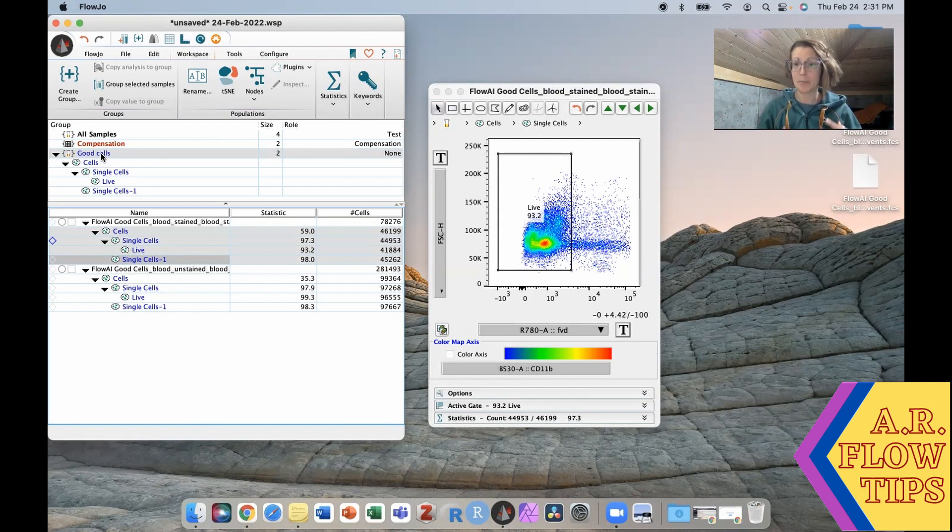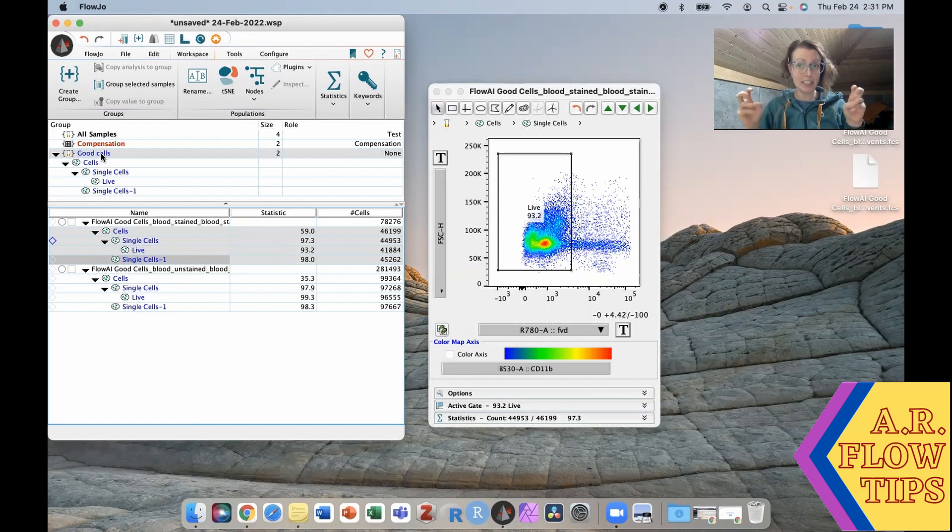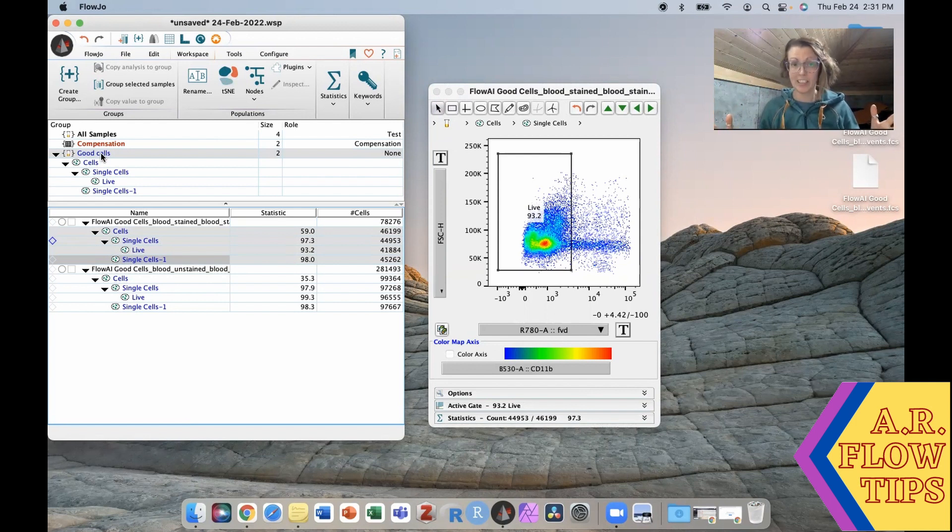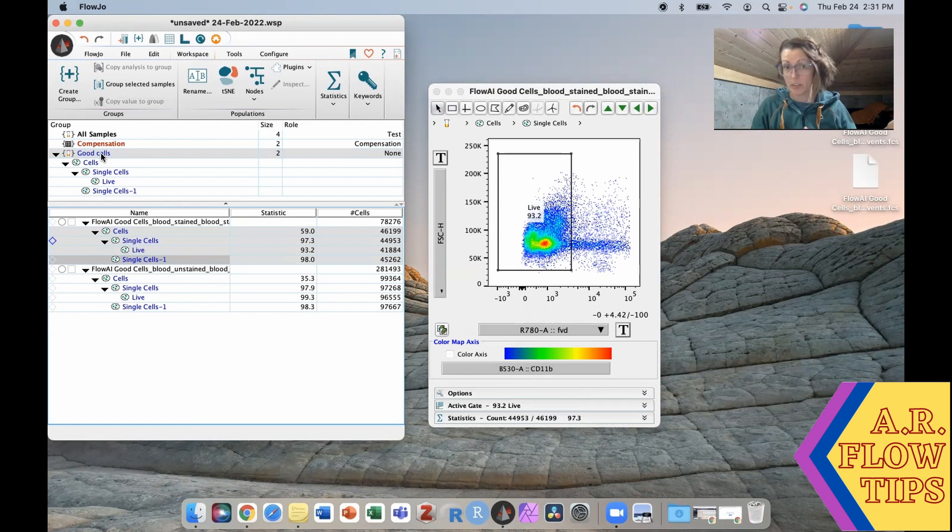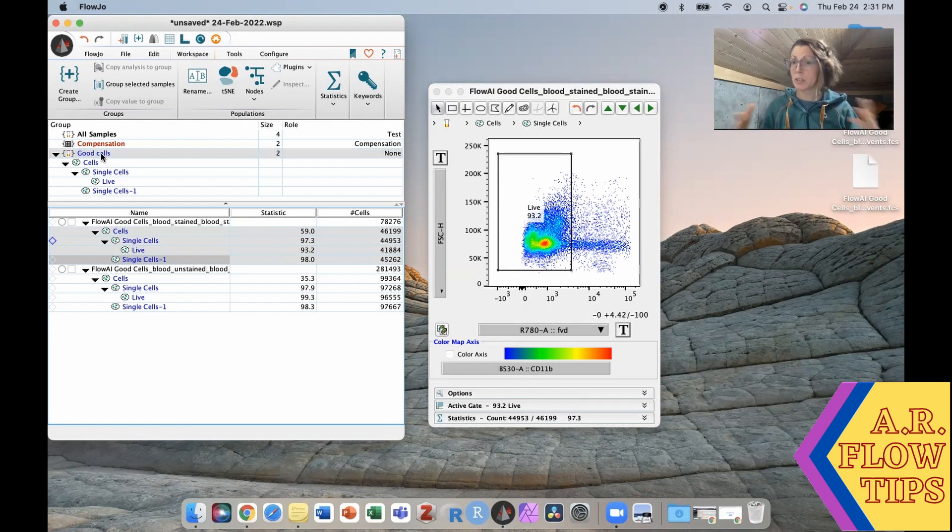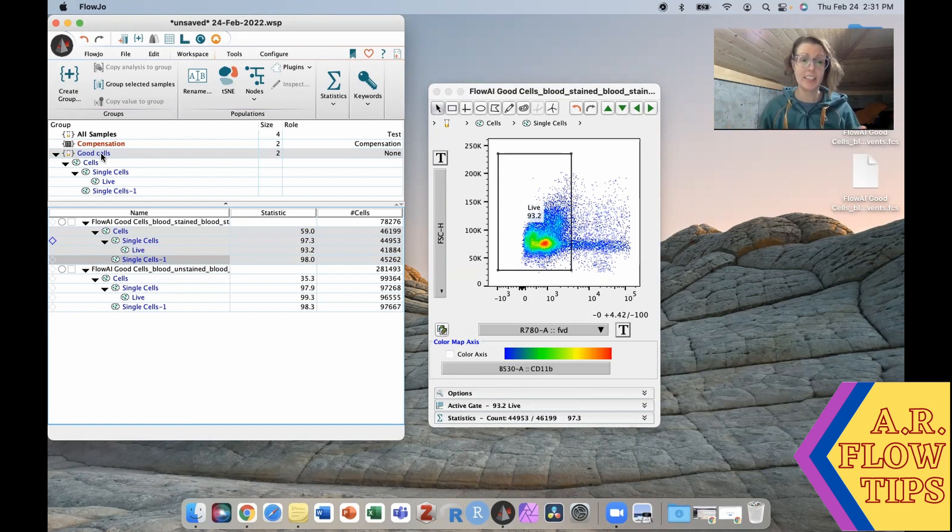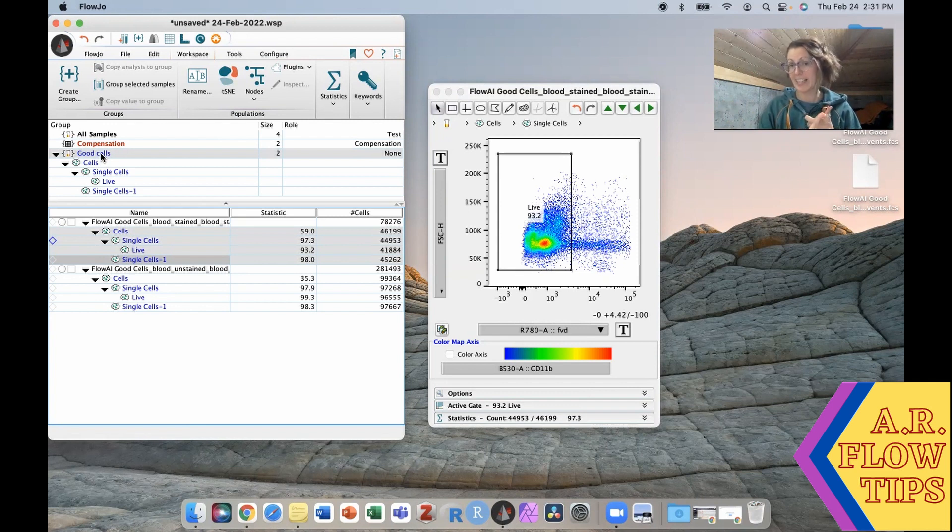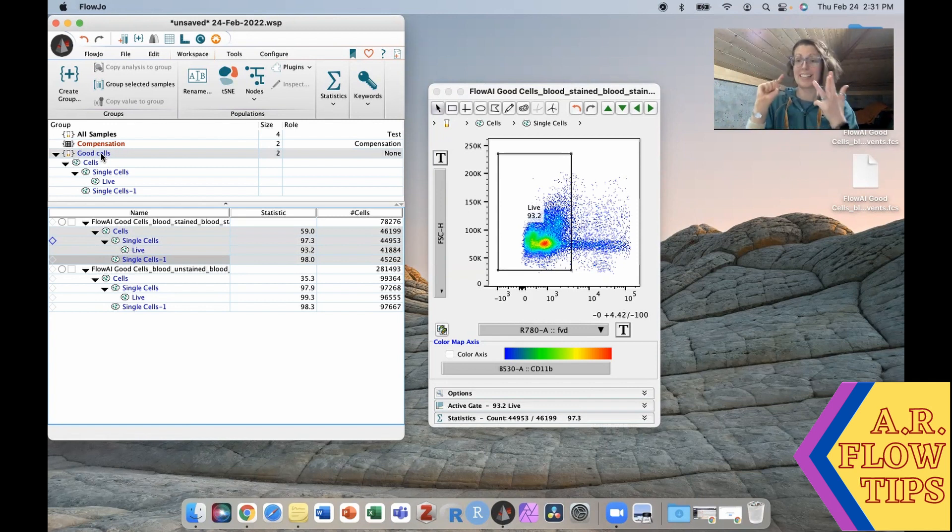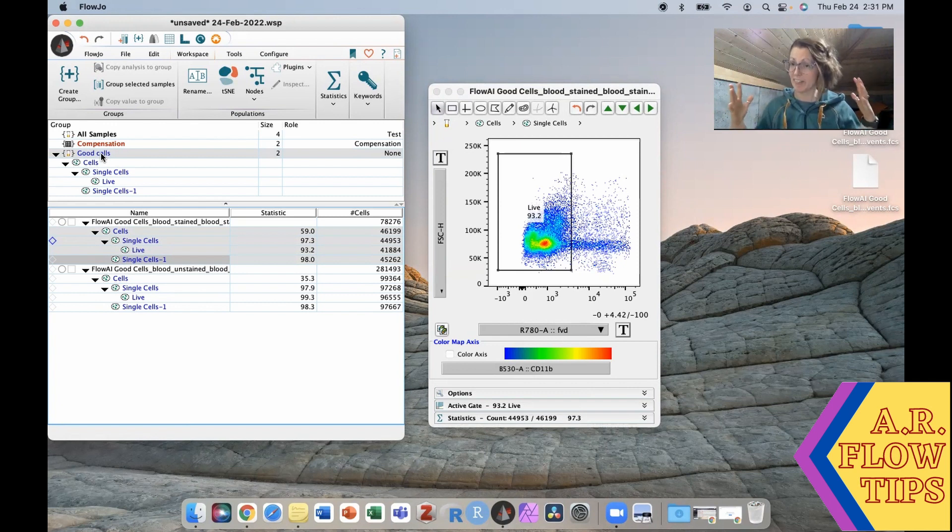So the basic steps one more time. Number one, remove any bad events where you may have had spurious fluidics. That's either with the time gate or with a plugin. Again look to see which plugin is best suited for your needs. Next up, remove debris and big clumps. Remove your doublets and then get rid of your dead cells and you will have a nice population to work with.